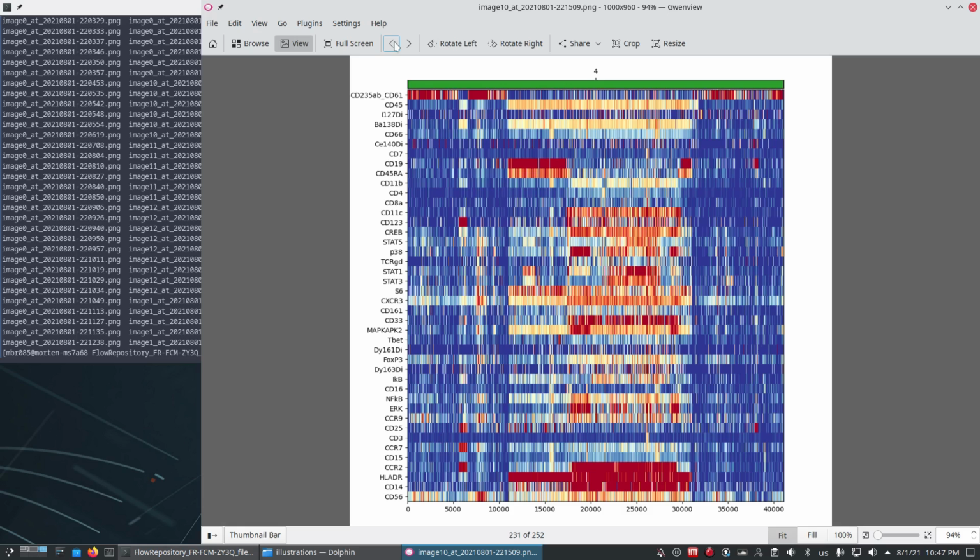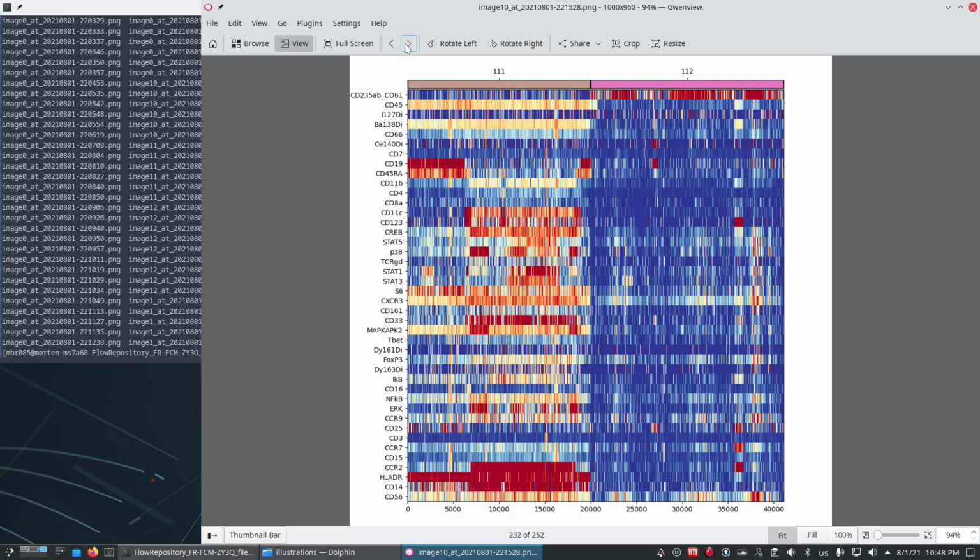So I think these are the neutrophils. So CD3 is negative, but where's CD66? CD66, oh, I don't know what these are. Well, they're not CD66. What kind of cells are they? They are HLA-DR. There are not so many. Well, there are 20,000 of them. I don't understand this. This is not a population that I'm used to. It looks a little bit like B cells. Some of them are maybe B cells, and some of them are, let's see, CD11B. What are these called? Are they called monocytes? I don't know. I'm not a biologist.